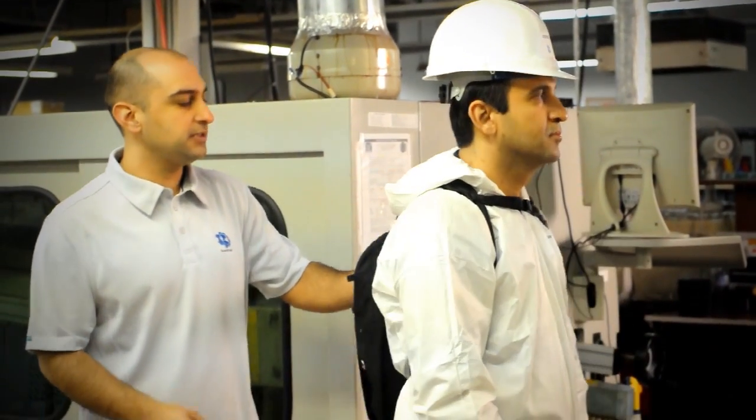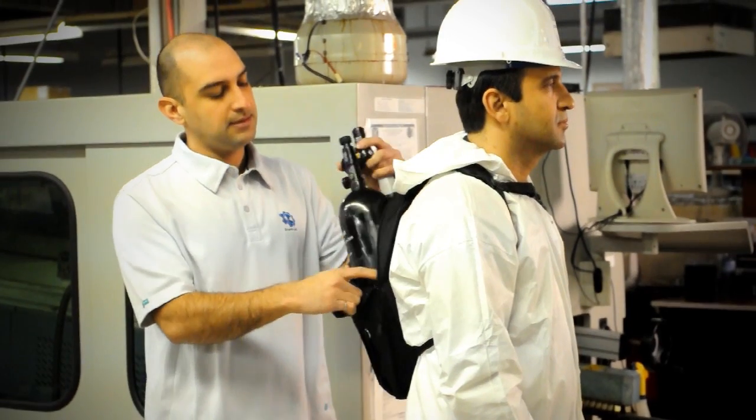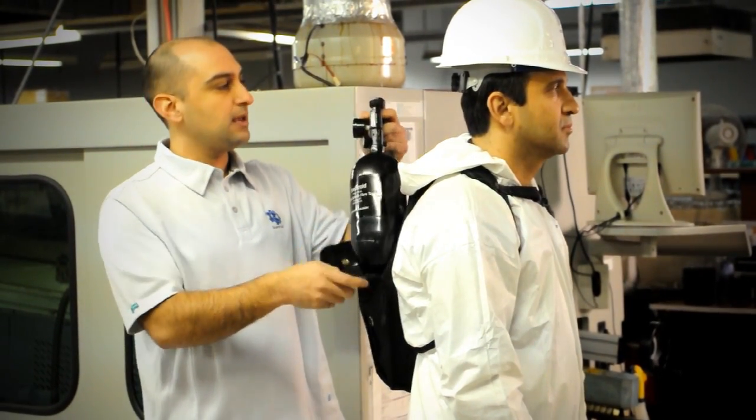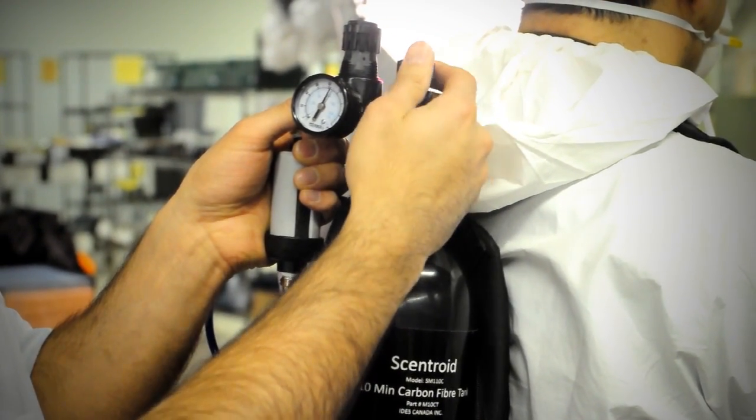So Darius is wearing the SM100. The first thing we're going to do is take out the tank. Here you see the carbon fiber tank filled with fresh air and I'm just going to help Darius by turning on the unit, the main valve.